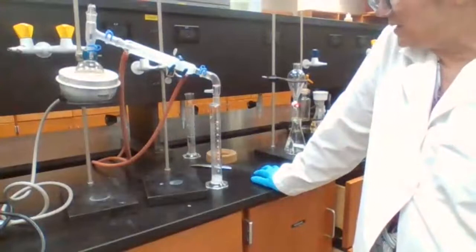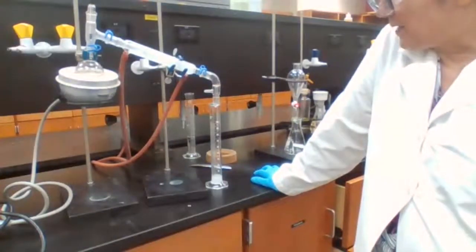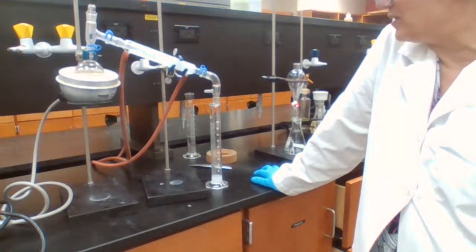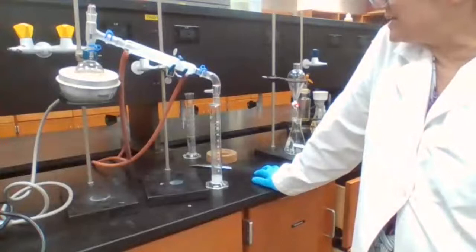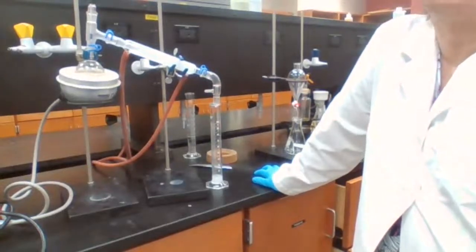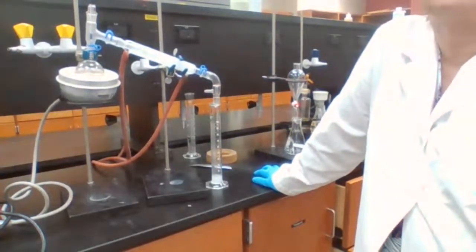Just trying to help you with some techniques and what could happen, or why later on we need the salt to actually separate the oily layer from the aqueous layer.